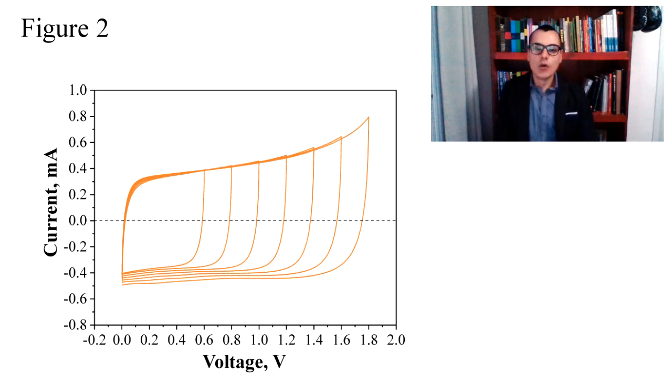Okay, from a practical point of view, electrochemical capacitors are stable and durable, thus it was necessary to confirm this scenario. Therefore, before Raman Operando analysis, 1000 cyclic voltammetry cycles were made with a scan rate of 1000 millivolts per second. It is clearly noted that the CV after these cycles exhibited a very good shape that confirms the stability and longevity of the cells.